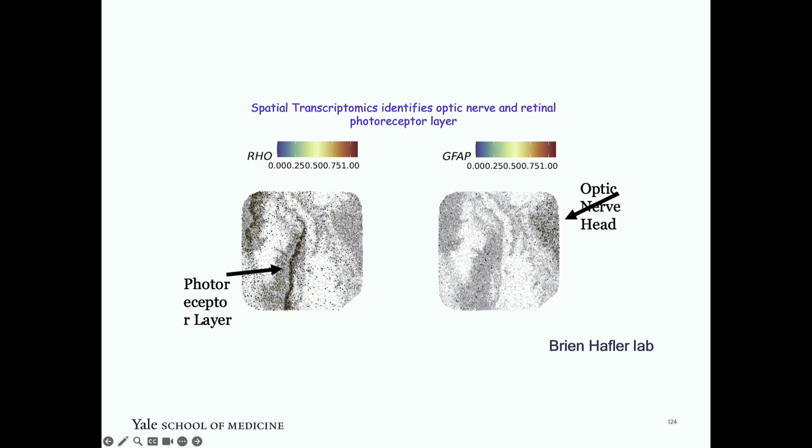So you can really see granular data, but the resolution of this method is 10 micron. That means if a cell is less than 10 micron, it will not be able to resolve those cells. But this kind of analysis is very useful for neighborhood characterization and general understanding of tissue.